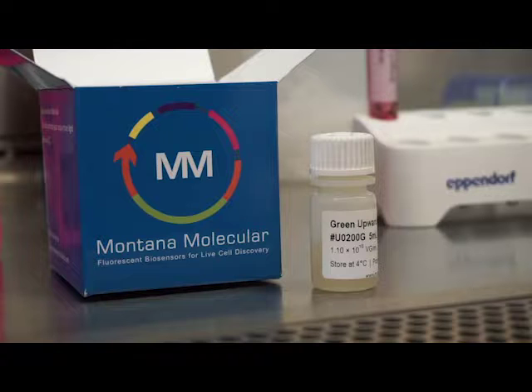BACMAM is an excellent delivery vehicle and can transduce a myriad of different cell types, such as standard cell lines, primary neurons, and stem cells. It's quite stable and has a long shelf life when stored properly. Finally, it's a BSL1 reagent and does not replicate in human cells.